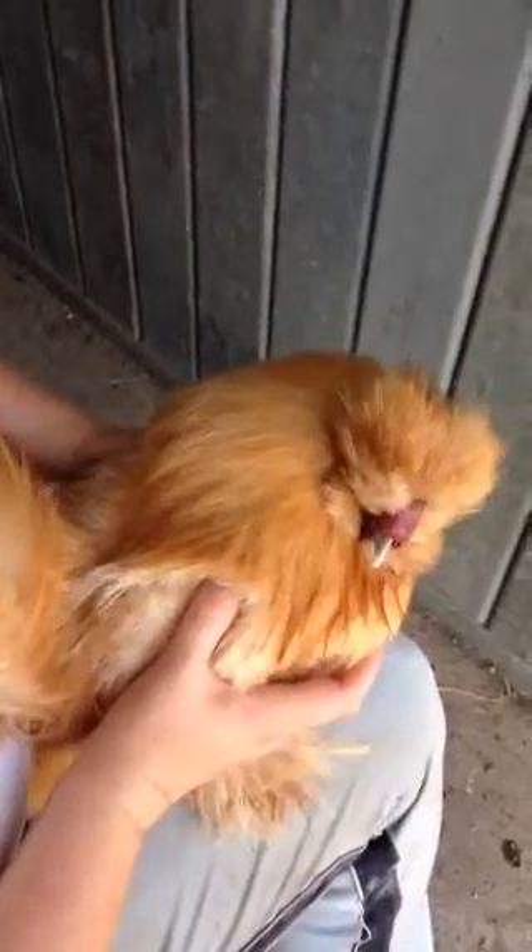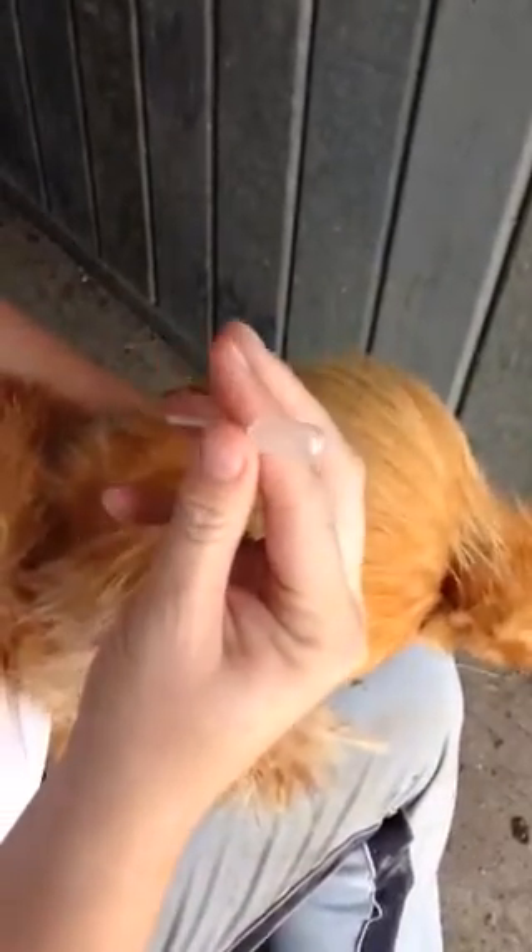I'm going to show you how to artificially inseminate a chicken using my buff silky. I use these little two millimeter pipettes that you order online. So you take the rooster, turn them upside down, and then you stroke the back.